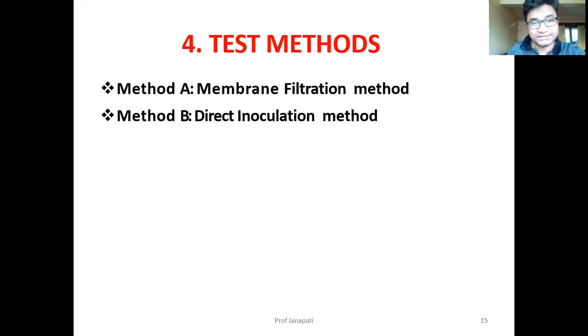So there are two test methods: the membrane filtration method and the direct inoculation method. You can select your method, but the most preferred method, which the pharmacopoeias prescribe, is the membrane filtration method.